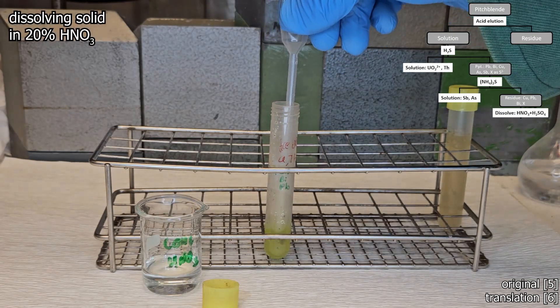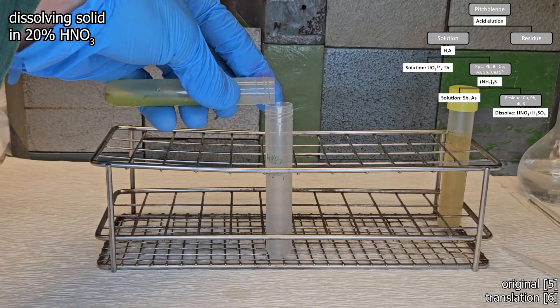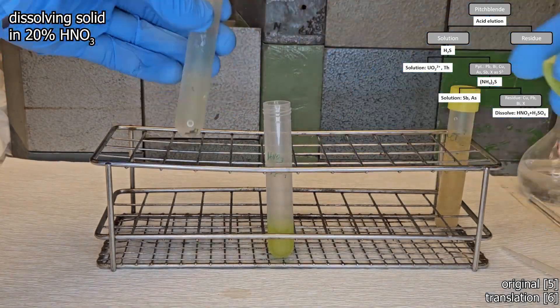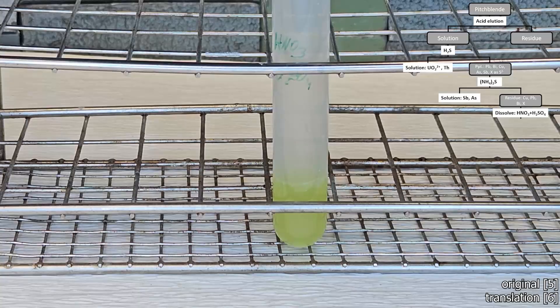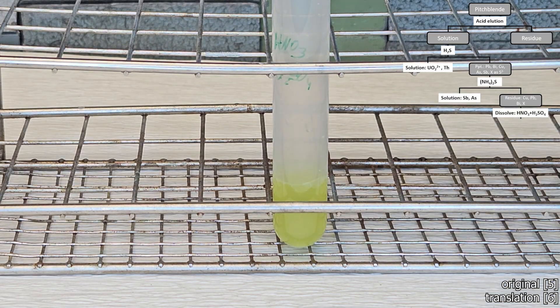The precipitate is dissolved in approximately 20% nitric acid by just shaking it. This converts all the heavy metal ions into a soluble form and once again it stings quite badly.